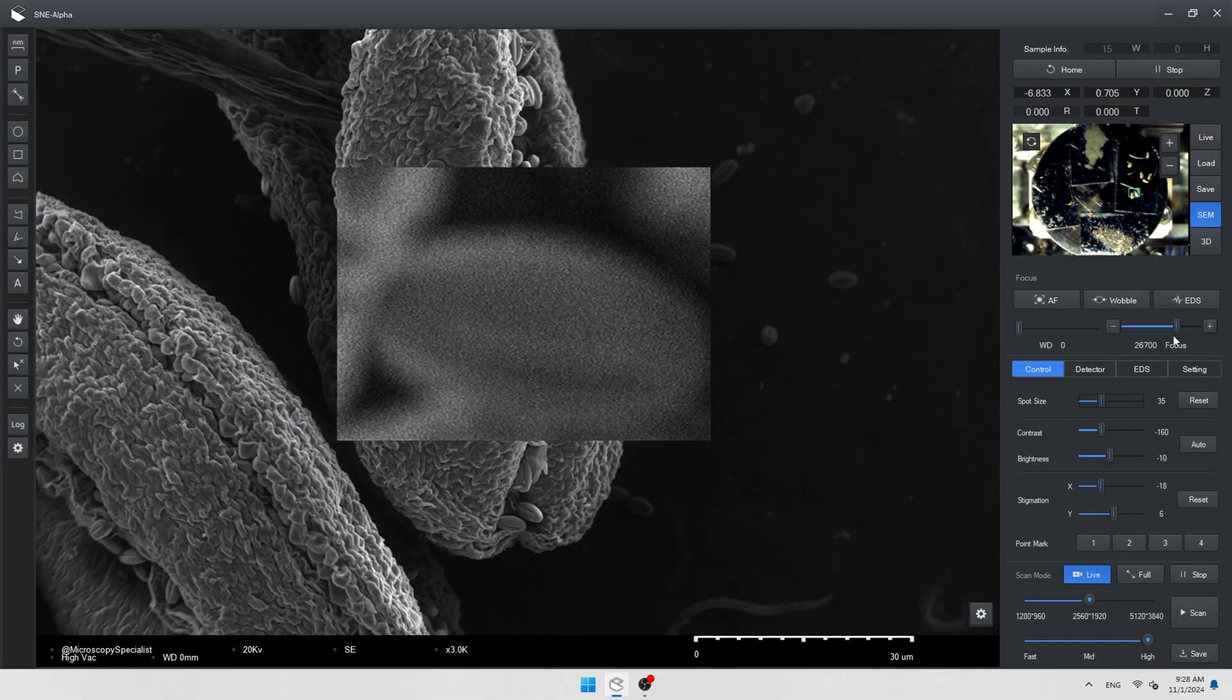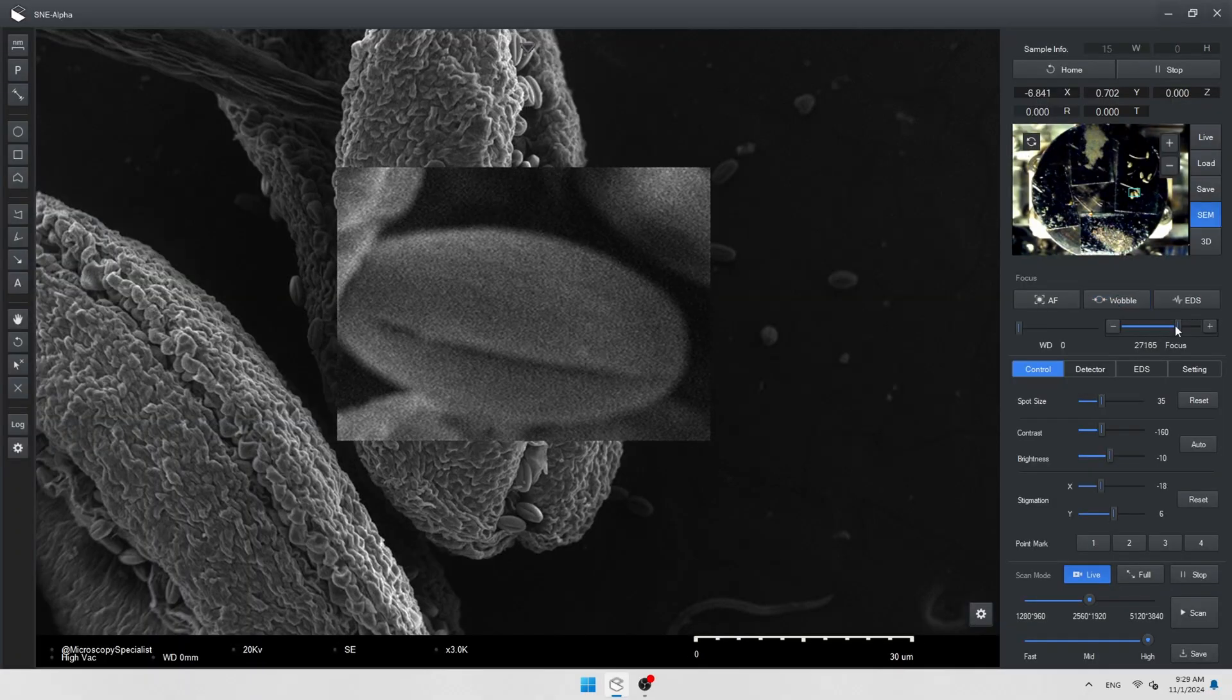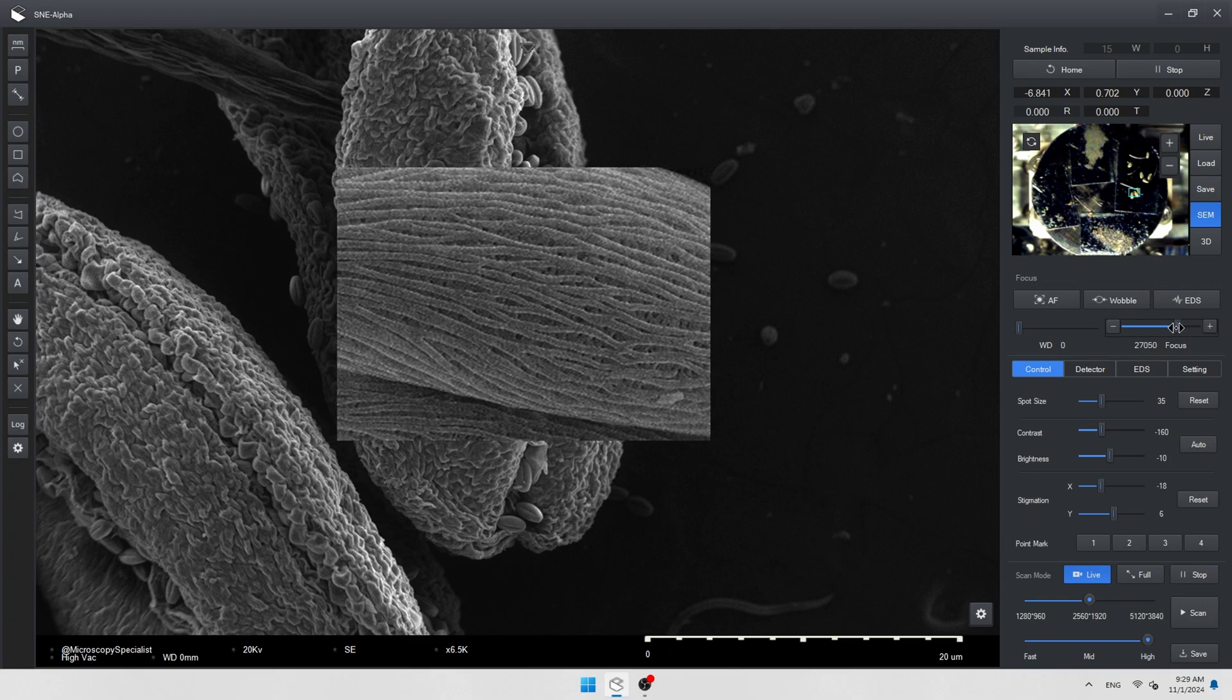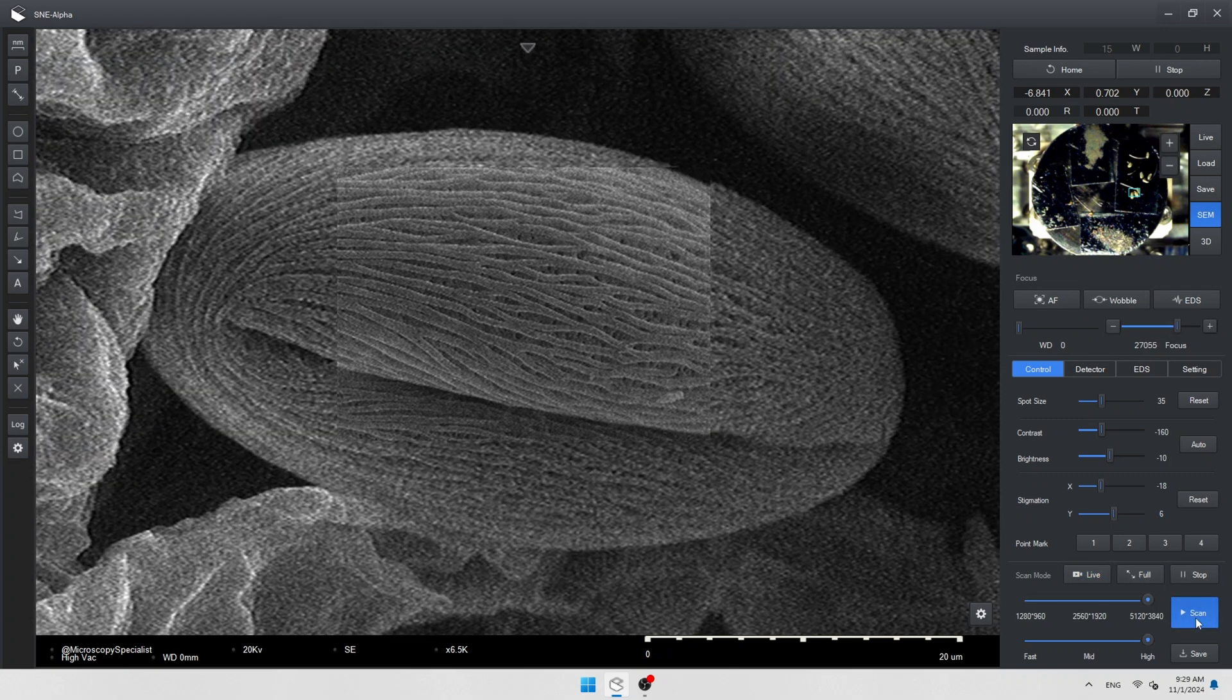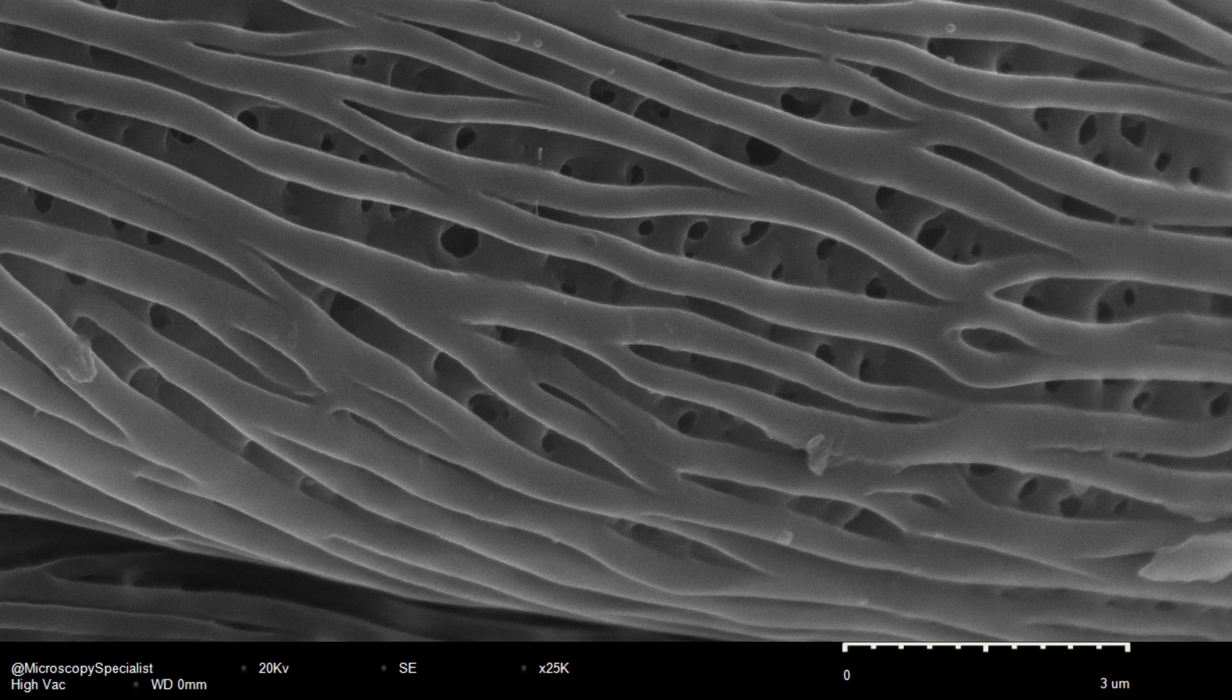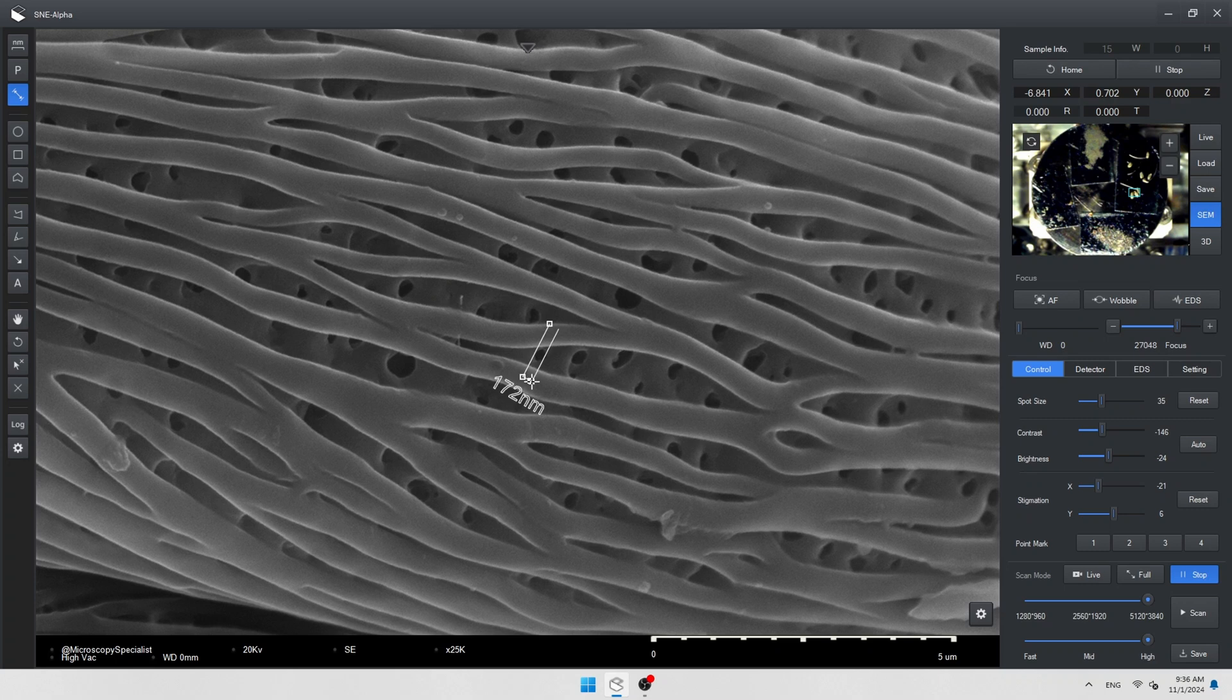But let's find some particular pollen grain, for example this one. We need to scroll the necessary magnification, make some adjustments with aperture and stigmation, find a nice spot, size and boom. Pretty impressive. And we can measure everything here. This tiny spot is less than 200 nanometers.